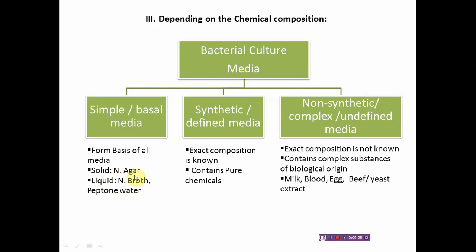All other media are basically prepared from the same composition by doing certain modifications in the basal medium. Synthetic media, as the name itself reveals, are derived from ingredients which are of synthetic origin. As we know the exact composition of the medium, it is known as the defined medium. The formula is well defined. It contains pure chemicals, basically from the synthetic origin.